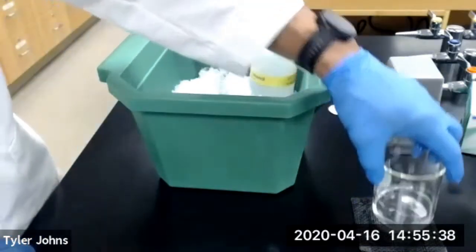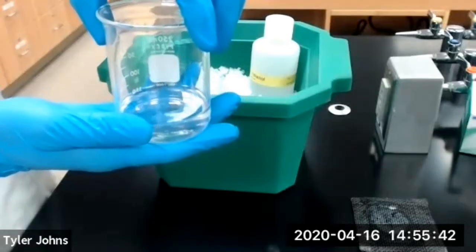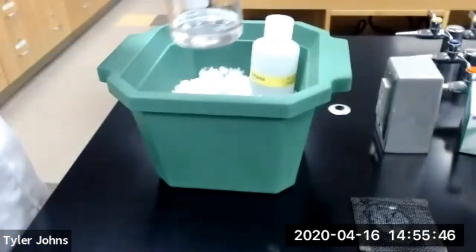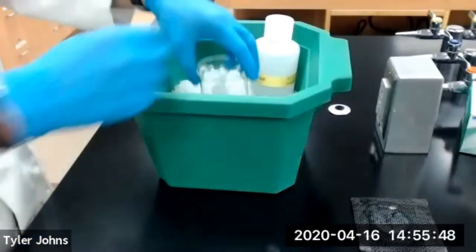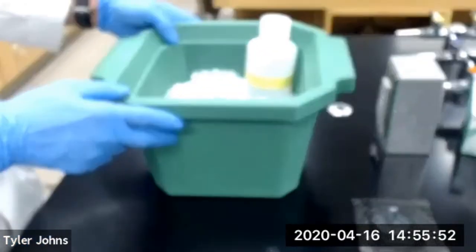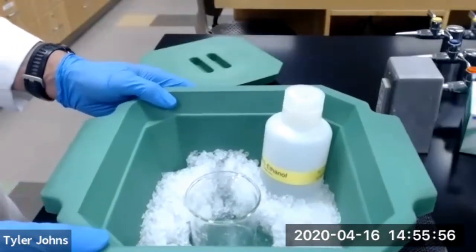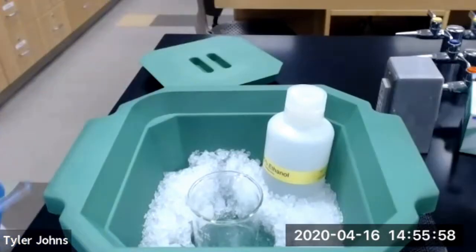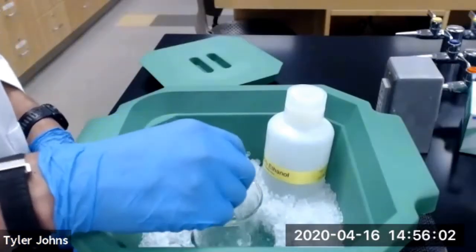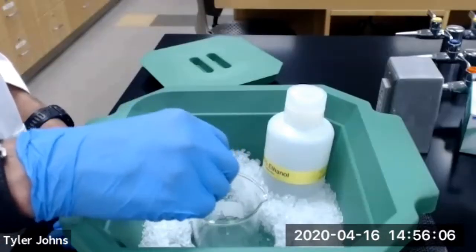Okay, so we've let our solution cool some. So now what we're going to do is set it in an ice bath. We have it in an ice bath here. And then we're going to stir with a glass stir rod for about 10 minutes. And as it cools, we should start getting crystals forming.